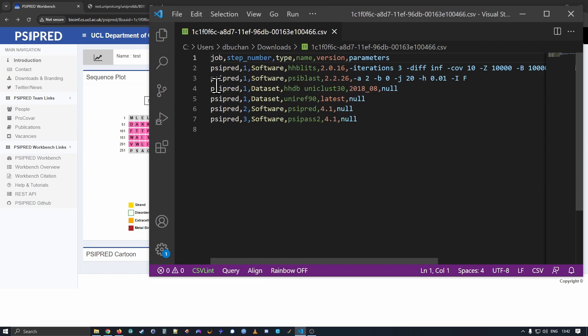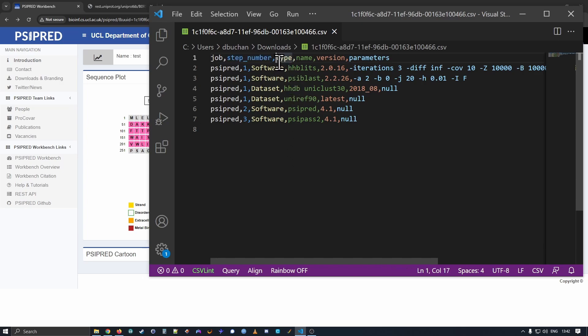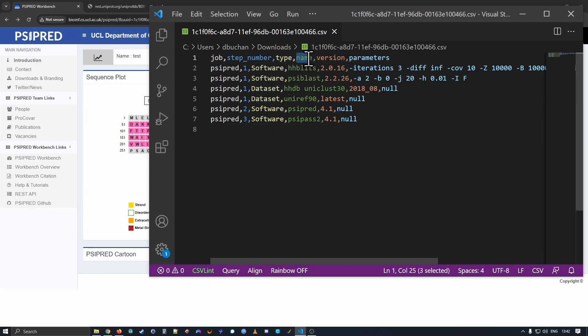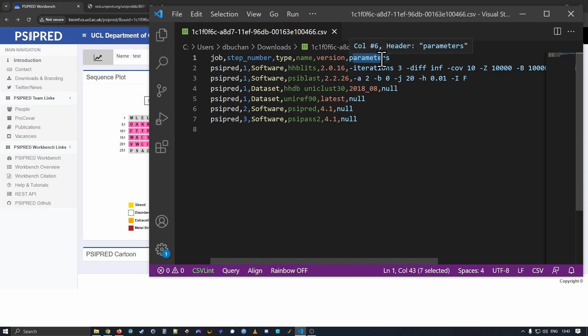This CSV file has a number of columns. The name of the job that you ran, the step number. So most of our jobs run in multiple sequential steps. These are numbered from one ascending. Then the type of information that you're being told. Are you being told information about a piece of software that was run, or a dataset that that piece of software was run with? Then the name of the piece of software, or the name of the dataset. Any versioning data that we have about either the software. And any default parameters that were used when this was run.